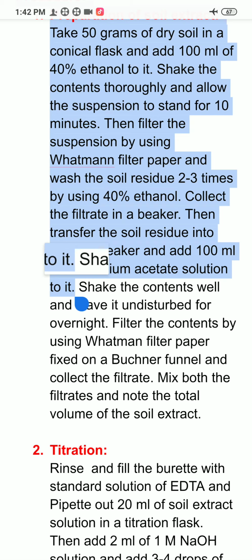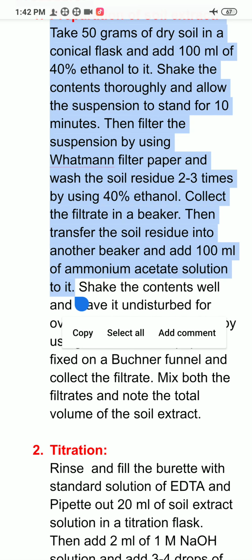Now why is 1 molar ammonium acetate solution added? 1 molar ammonium acetate solution will react with the soil and it will release the calcium ions, or extract the calcium ions from the soil in exchange for ammonium.